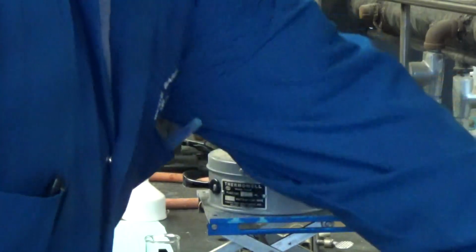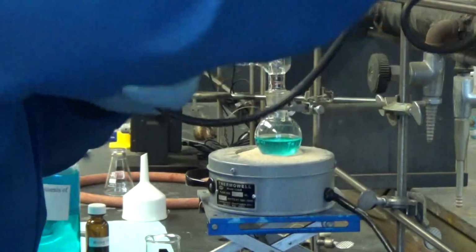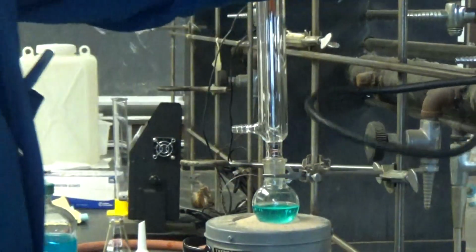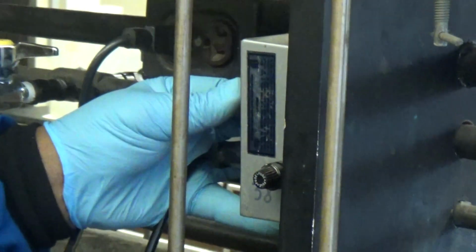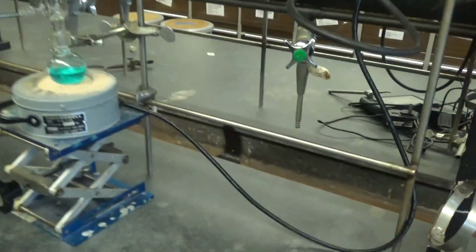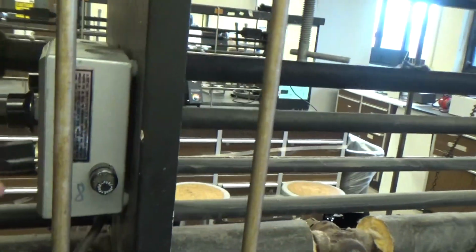Okay. So we have that here, and it's set to go until 5. I think you're backwards. I think this goes one there. Yeah, that's over here. And this one goes over here. So let's make sure we understand this. We have the sand bath going into the regulator, and the regulator goes into the power.